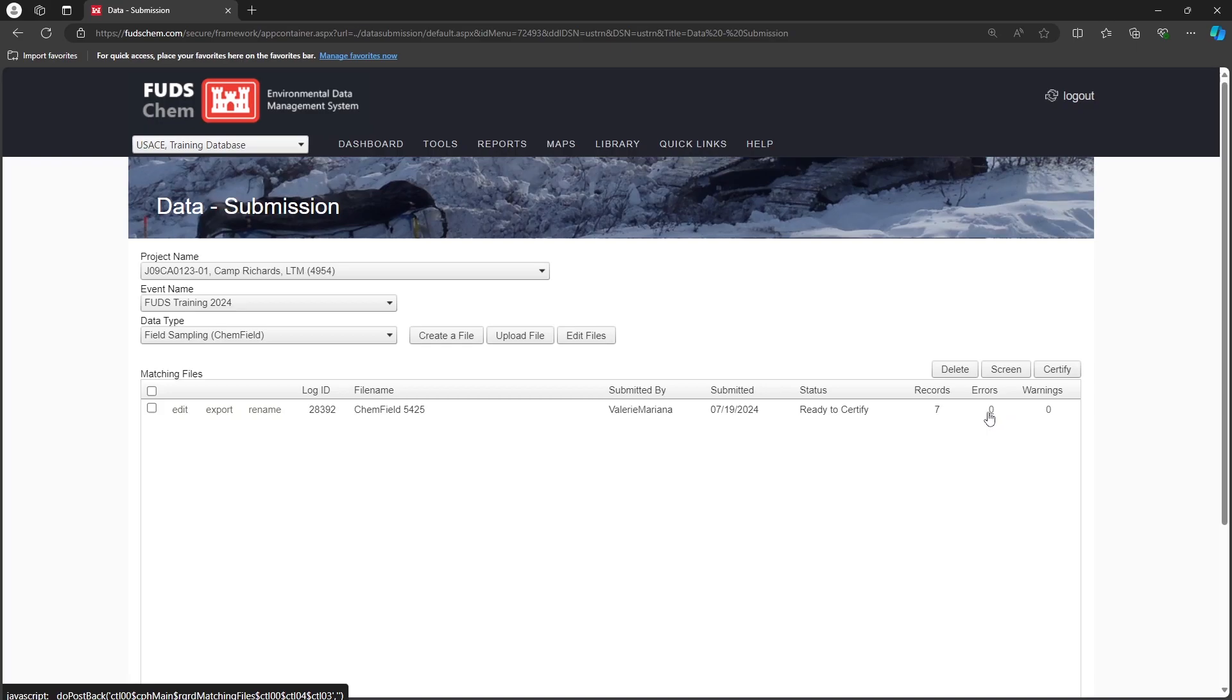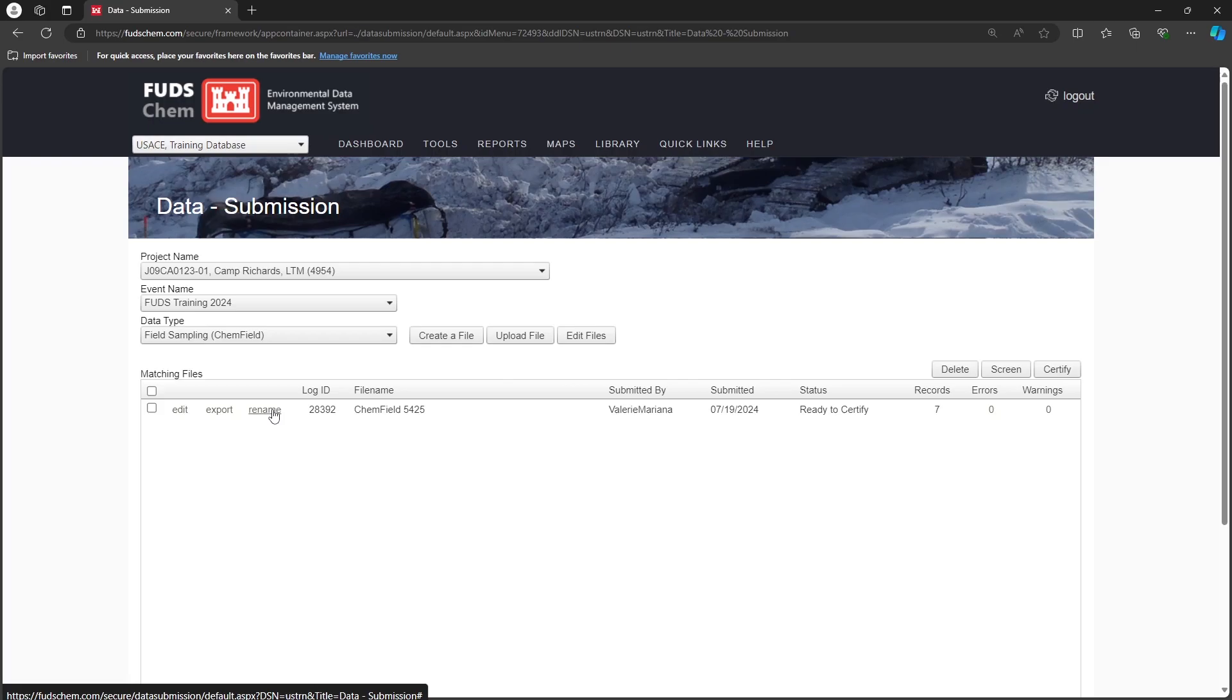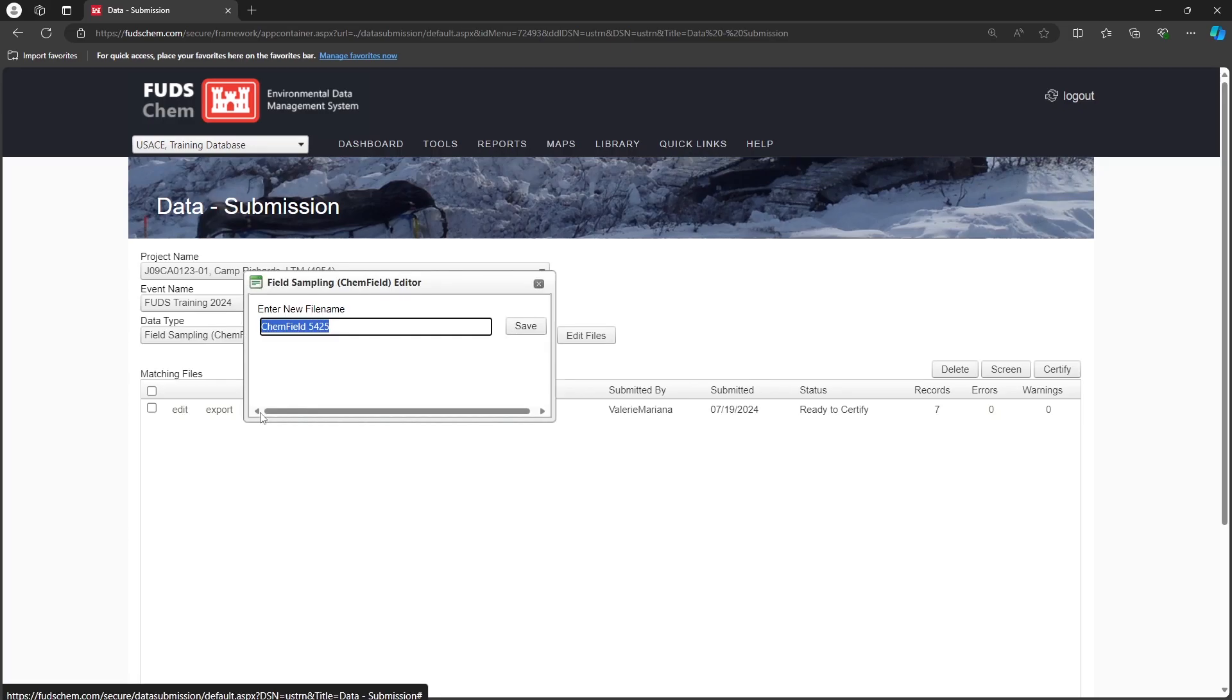First, let's rename the file so that it will be easy to identify later. We recommend naming Chemfield files after the CoC ID. In this case, CoC 081124A.